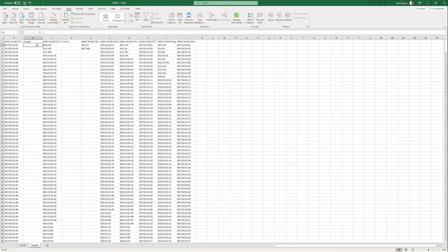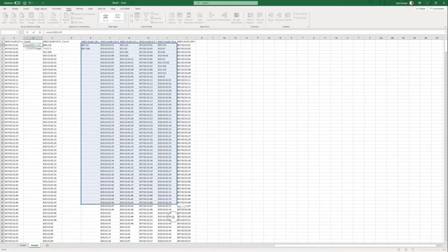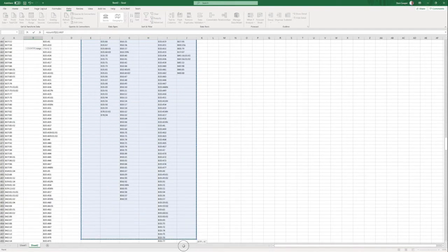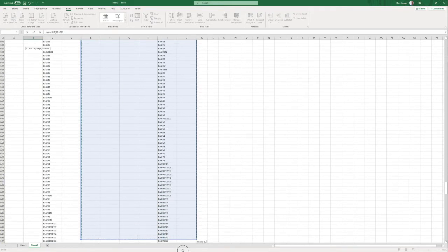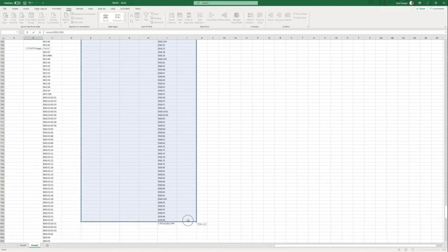So the formula I'm going to use is called COUNTIF. Many of you may be more experienced with Excel than I am and have a better way of doing this, but for those who aren't, you can just copy the formula that I'm using. Equals COUNTIF. Now we're going to count in this range here. Funnily enough, we found one C allele, which was a perfect match there.